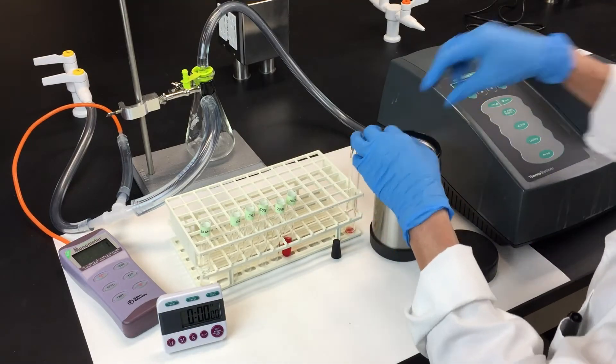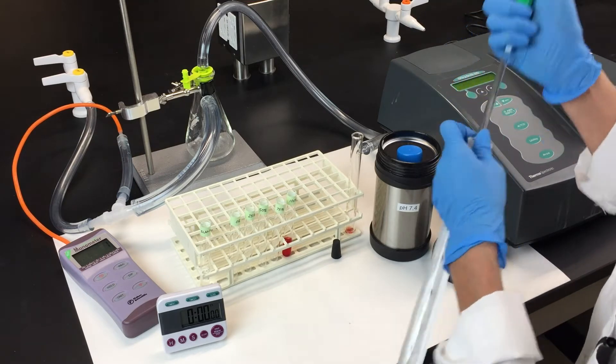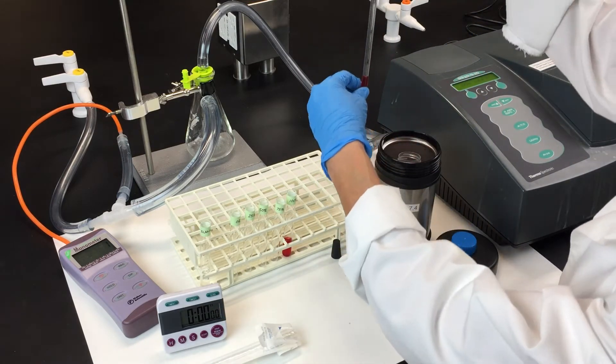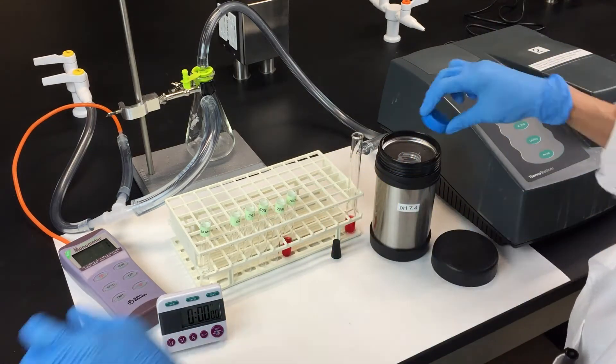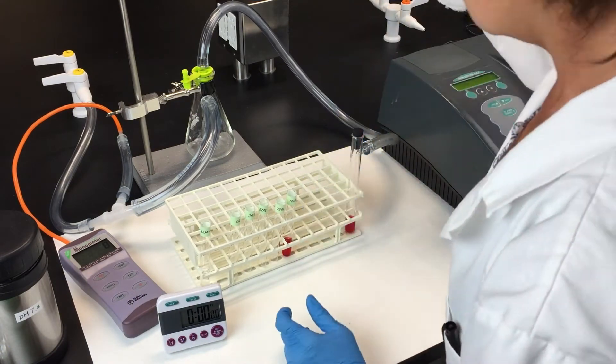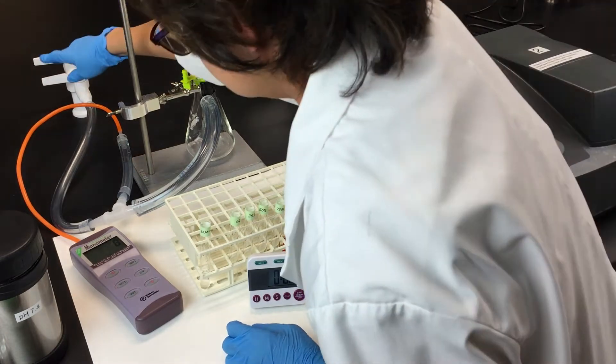Place 2.5 milliliters of the hemolysate in the side arm tube attached to the vacuum system. Seal the tube with the rubber stopper and slowly open the vacuum until it reaches its highest vacuum pressure possible.